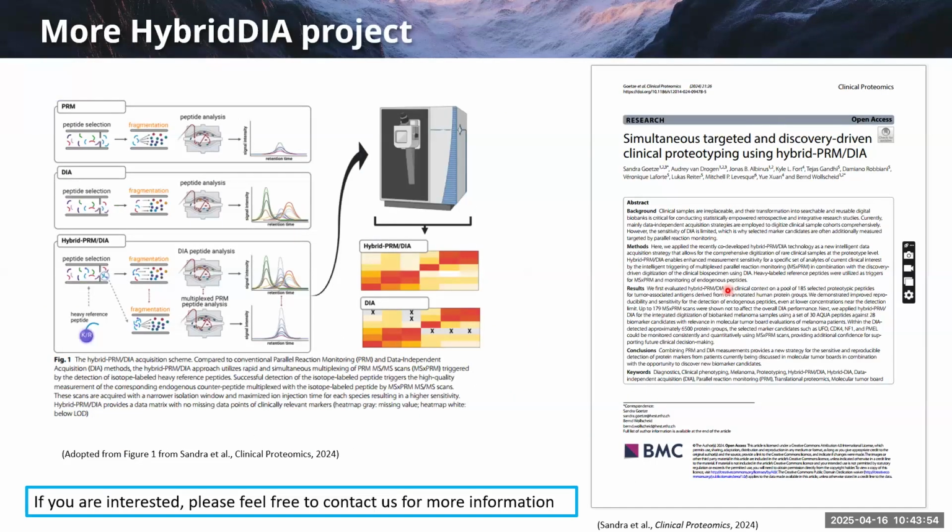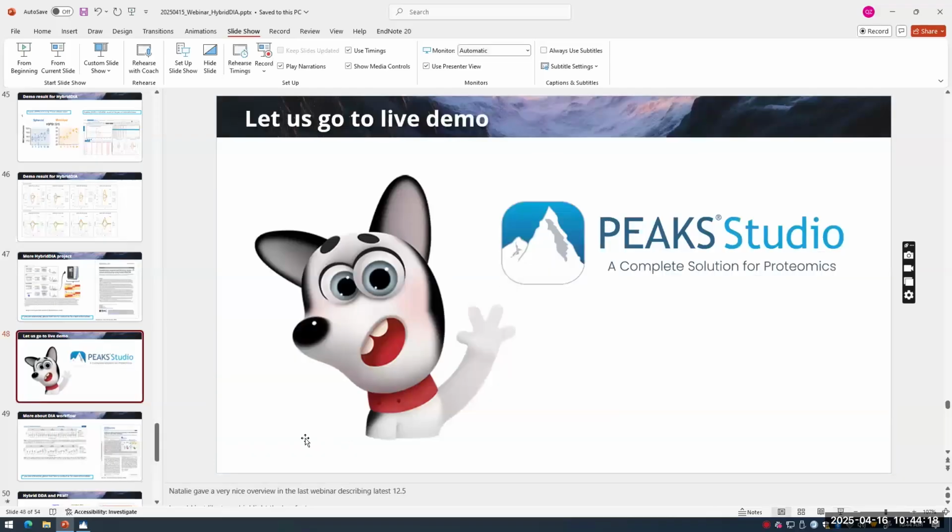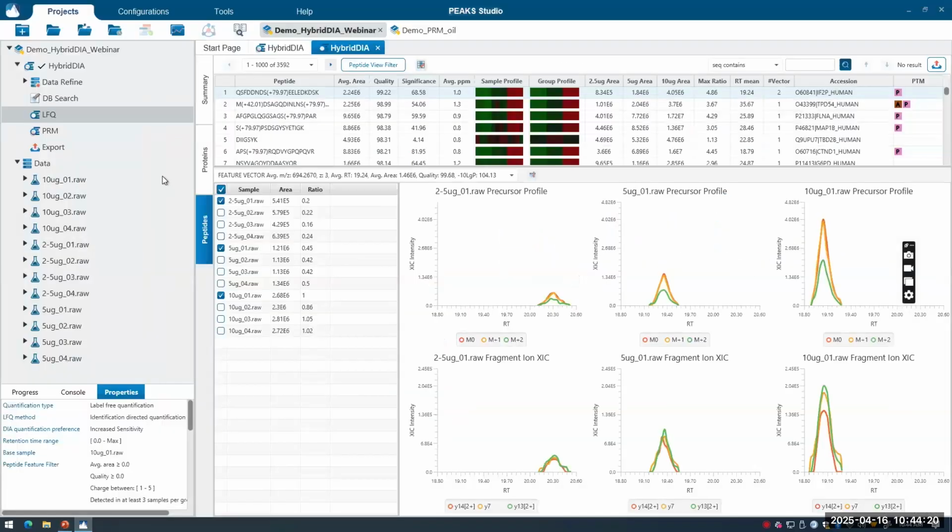Besides the paper from Professor Alton's group, there is another paper from Professor Bernard's group. If you are interested, you can contact us and we can talk with you more about this demo project. Okay, now we go to the software to show you some of the software.